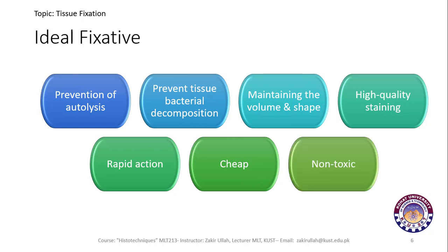The last property of an ideal fixative is that it should be non-toxic to the tissue as well as to the person who is dealing with the fixative. So, these are the properties of an ideal fixative that should be used for the fixation of tissue in the histopathology lab.